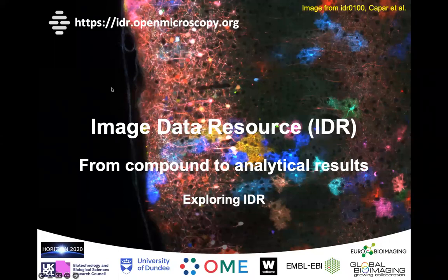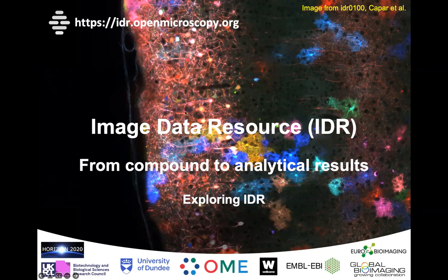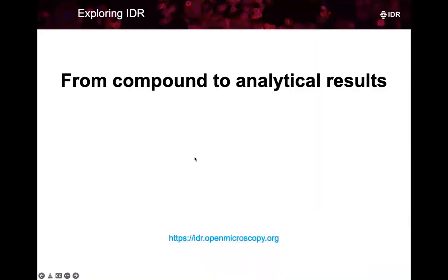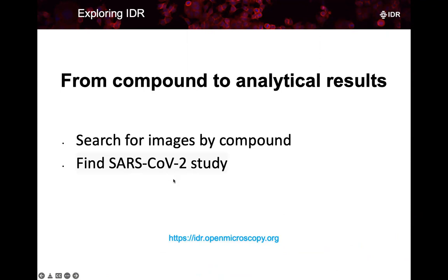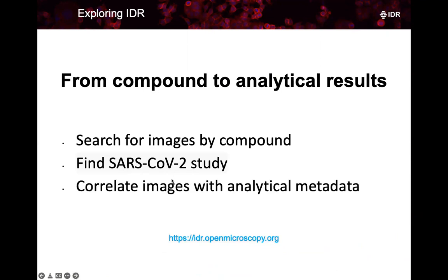Hello, this is Peter from the IDR team. In the Exploring IDR series, I will show you how to go from compound to analytical results. We will start searching for images by compound and we will find an interesting SARS-CoV-2 study and correlate the images with the analytical metadata.